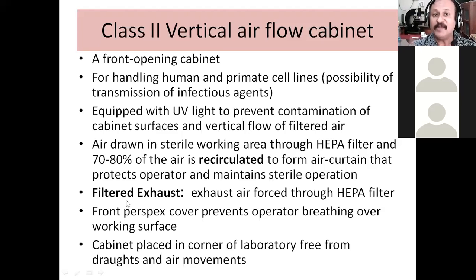And then one more essential important thing is there, and that is it has got a filtered exhaust. What is the meaning of filtered exhaust? The air coming in is filtered through the HEPA filter that everybody knows. The air which is going out of that chamber, out of the cabinet, is also filtered through a HEPA filter. Do you understand what I'm saying? So there are two filters now, one at the top and one at the bottom, below the working surface. So air which is coming inside the cabinet is filtered, and air which is going out of the cabinet also is filtered.